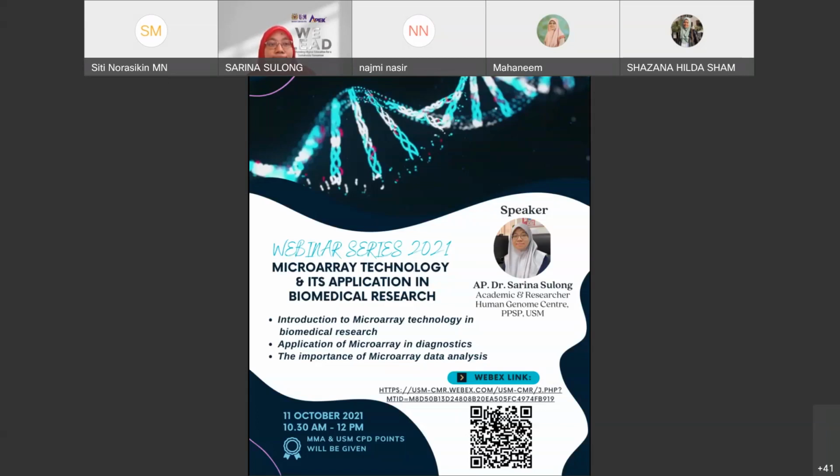That means for methylation you have to do this genetic study, right? Yes. We can detect the hypermethylation status using methylation specific PCR, or you can do sequencing, or you can do the microarray. Which is the best method? It depends on your samples and the purpose. What do you want to see? Do you want to see the whole genome, or is it targeted? If you just want to check only a few genes, you can just do MS-PCR, methylation specific PCR. Normally we have to do the bisulfite treatment first, and then you can go directly to DNA sequencing also.